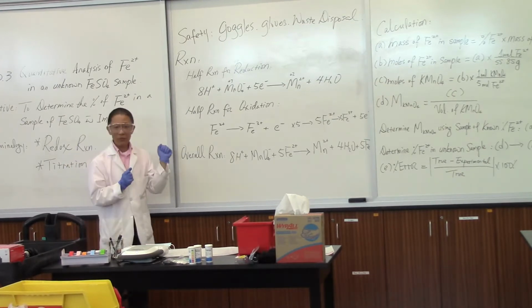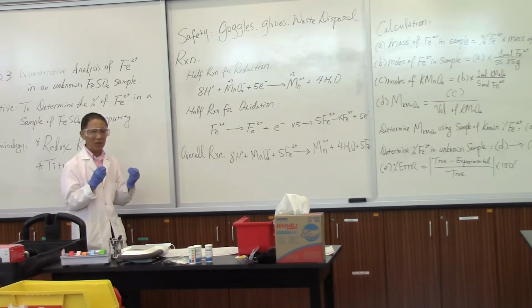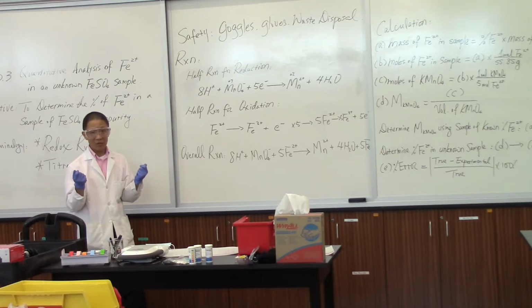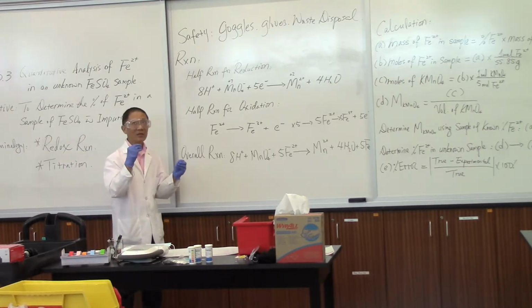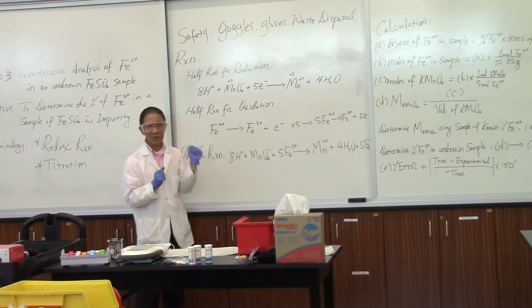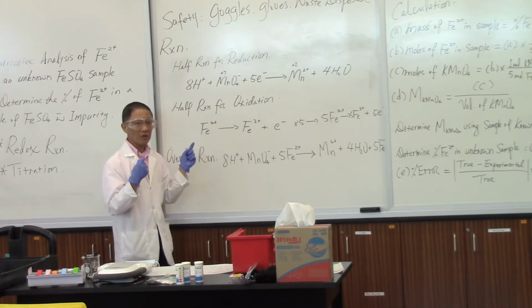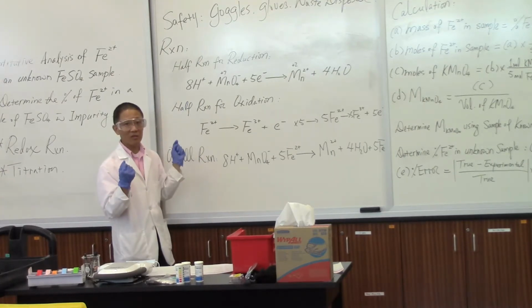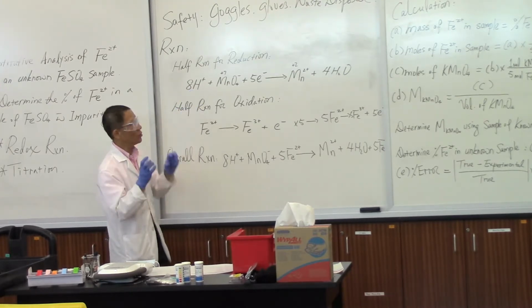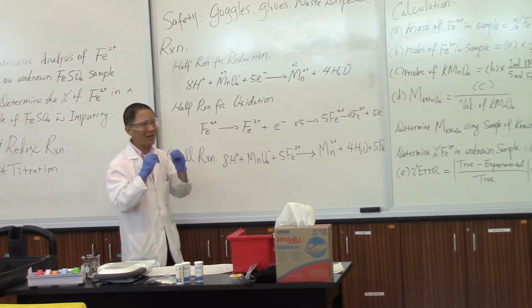So in terms of the reaction, going back to the redox reaction, you may remember from Chem 101 that one part receives electrons and the other part gives them out. So let's write out the ionic chemical reaction equation as what we call half reactions. For the half reaction of the reduction, remember reduction is the gaining of electrons. This experiment has to happen under acidic condition, so we need to use hydrogen ion or hydronium ion when we write out the balanced equation. Potassium permanganate, KMnO4, we're using the net ionic equation.